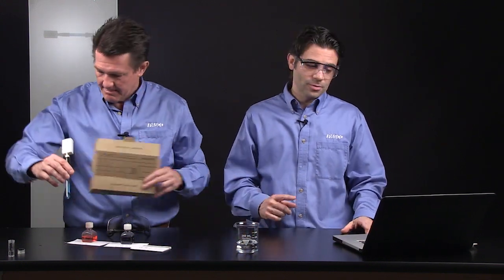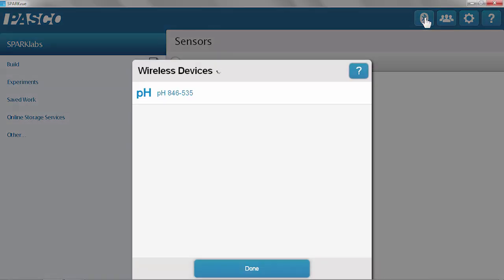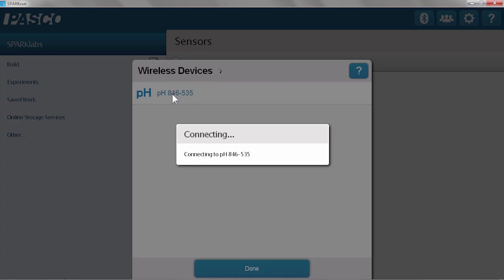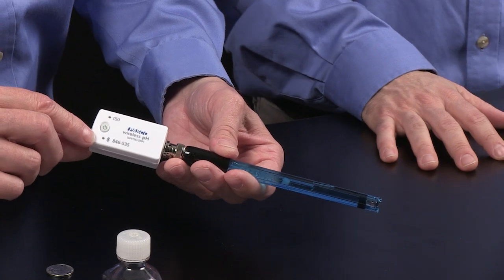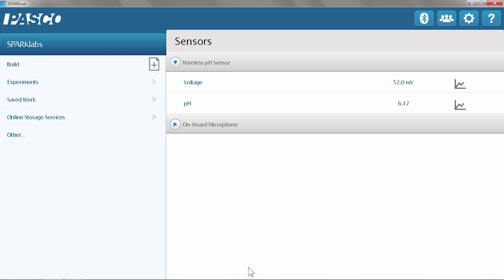Now we want to connect that to our software. I'm using SparkView software and I'm going to go into the Bluetooth settings. Because this is a BLE device, I can use in-app pairing. Once I hit that Bluetooth button, it'll find the device. I can just touch the device based on the number, which is right on the top — so if there's a classroom full of them, you can identify the correct one. Once I touch it, it'll confirm it's connected because a green battery icon will show up and the light starts to turn green. I'll hit done.